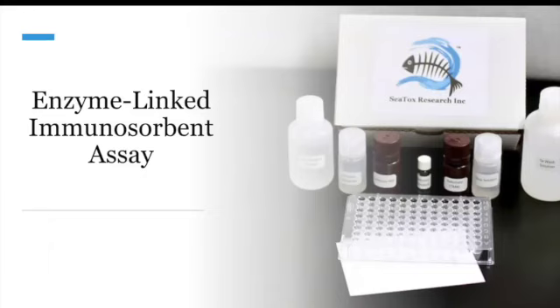In this video, we're going to be going over how our Saxitoxin ELISA works. Think of this as background information on the technology and overall concepts of the method. The assay is an ELISA, which stands for Enzyme-Linked Immunosorbent Assay, and there are two key terms in this acronym.